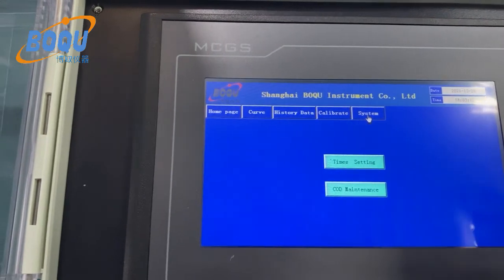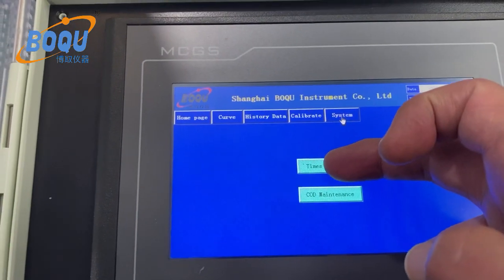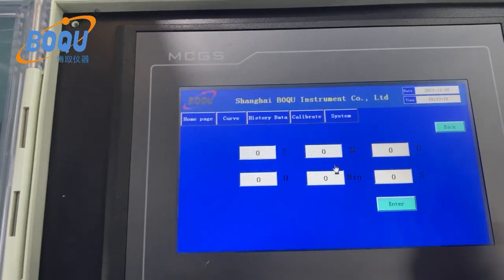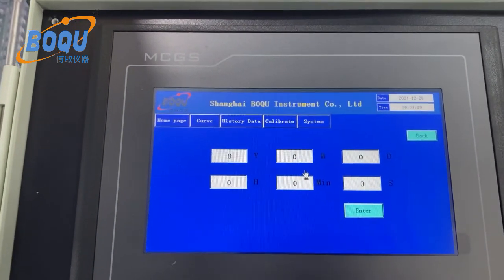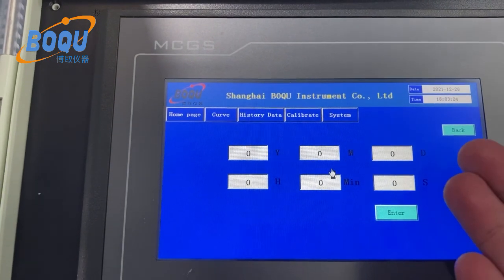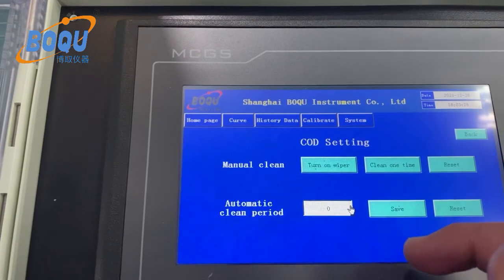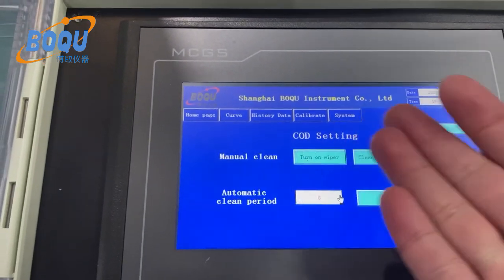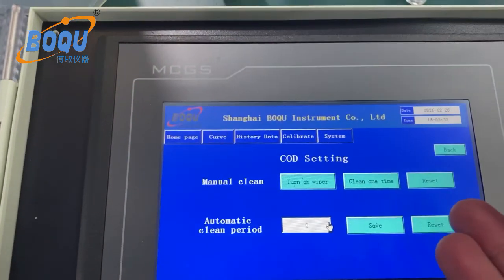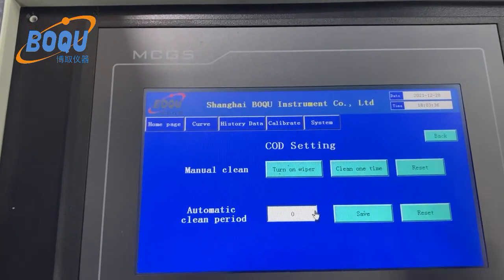Here is the system settings. Here is the time setting — different countries have different time zones, so you can set the time according to your local region. Here is the COD maintenance setting, which also includes the auto-clean wiper — manual clean and auto-clean COD settings.